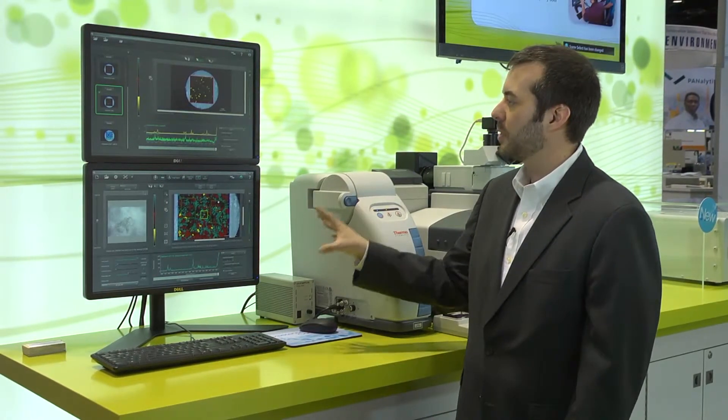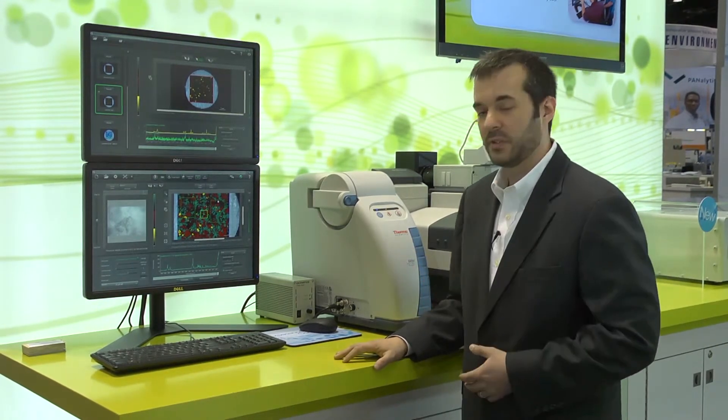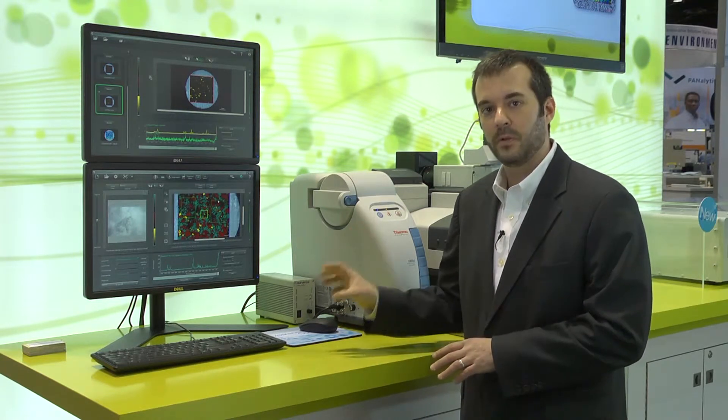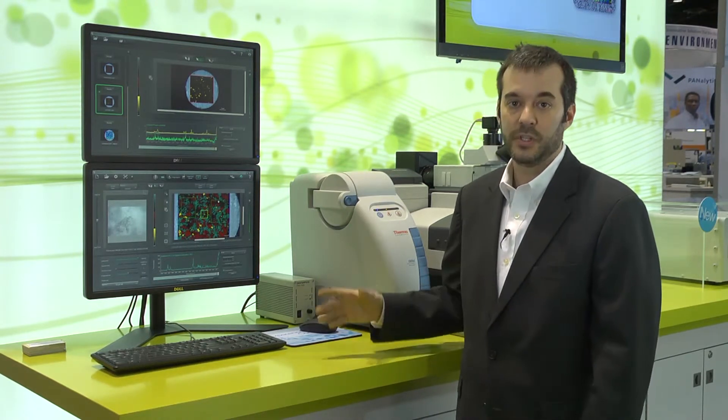We're also looking at problems in academia where the primary expertise isn't spectroscopy. So we're looking to have a system that can be used by engineers, physicists, chemists, to biochemists, really being a focal point for all of that research activity within a multi-user interdisciplinary laboratory environment.